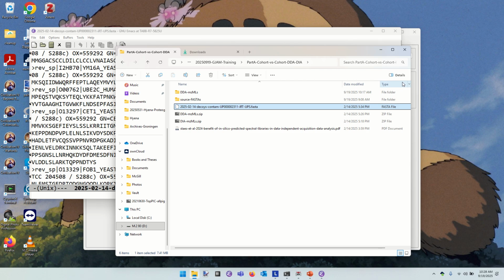But it's very important for us to be able to control the false discovery rate of identification. And for that, every protein in this database appears in two forms. It appears in the normal orientation as downloaded from UniProt, and we reverse it, N-terminal for C-terminal, and add that as a decoy sequence. Okay, so we're going to compare each spectrum to twice as many peptides as are real, just as a way to control our false discovery rate. That database is what we'll then supply to FragPipe for the search.